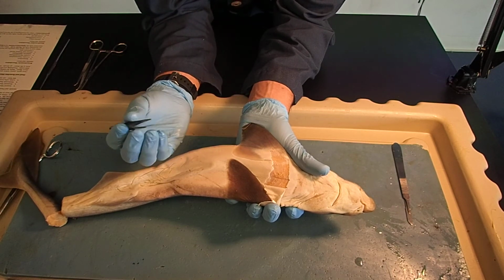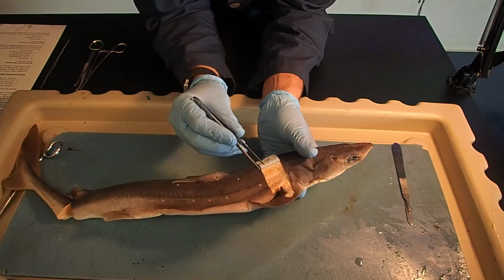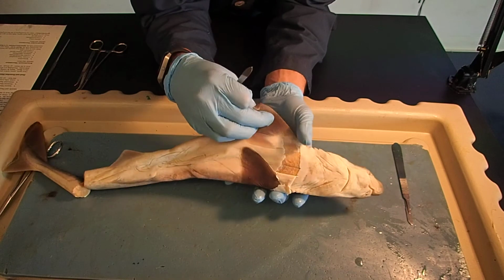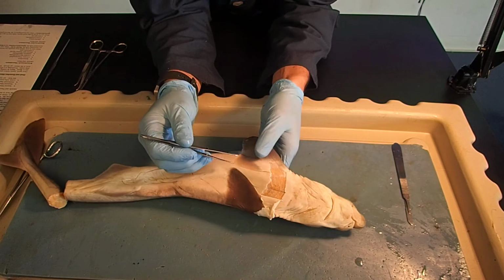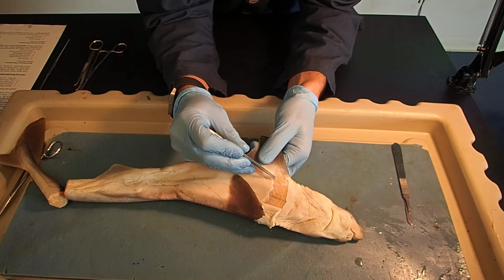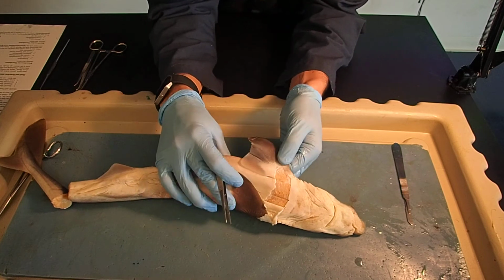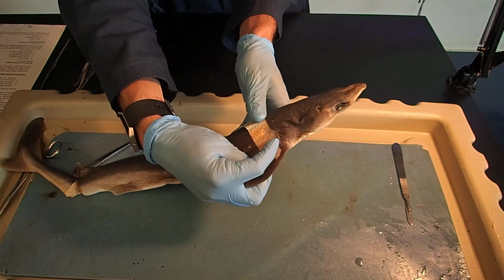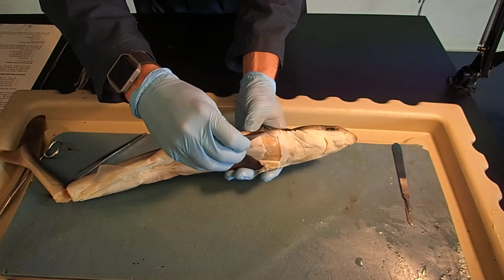Septum is like a canal. Myoseptum is the space between the muscles. Septum for space. Just like we have a horizontal septum, this was space running between the epaxial muscles and the hypaxial muscles. Myoseptum running between my myomeres. Underneath here, once again, you can see this distinctive muscle right here. This muscle is going to be my pectoral adductor. If I contract that muscle, it's going to bring the fin into the body. If I contract the abductors, it brings the fin away from the body. Adductors, it brings the fin back towards the body.